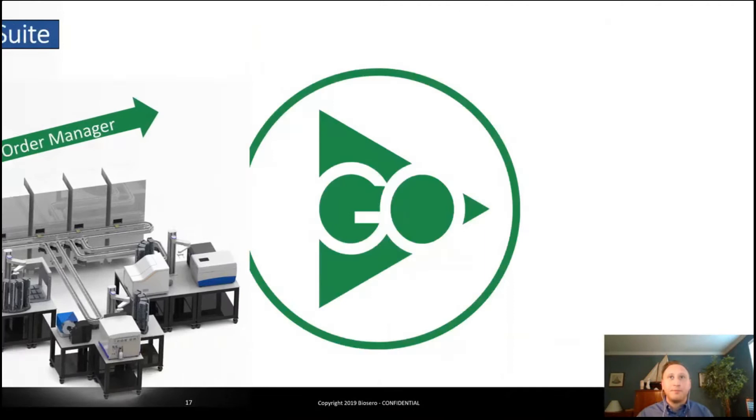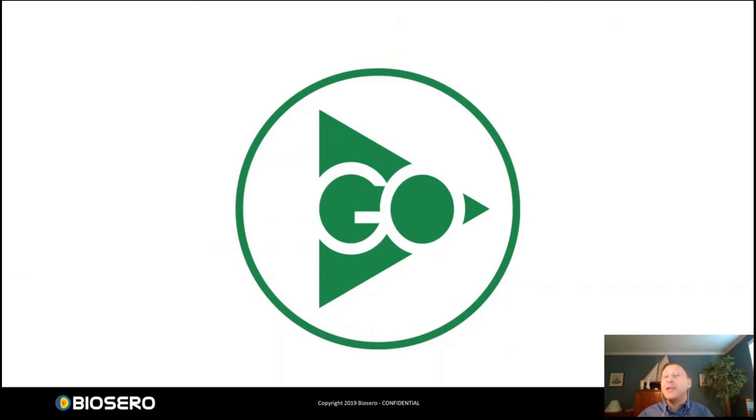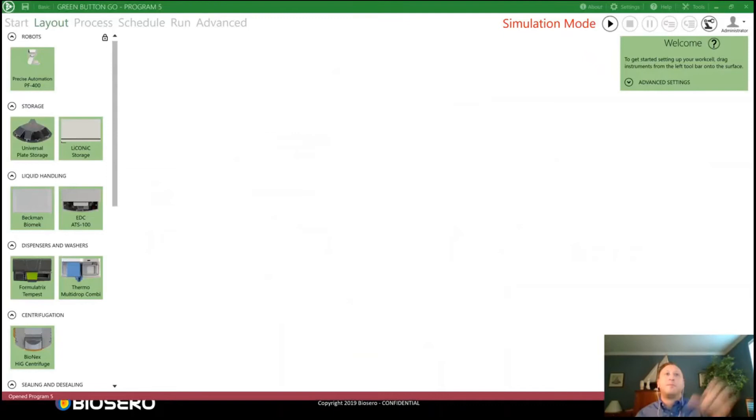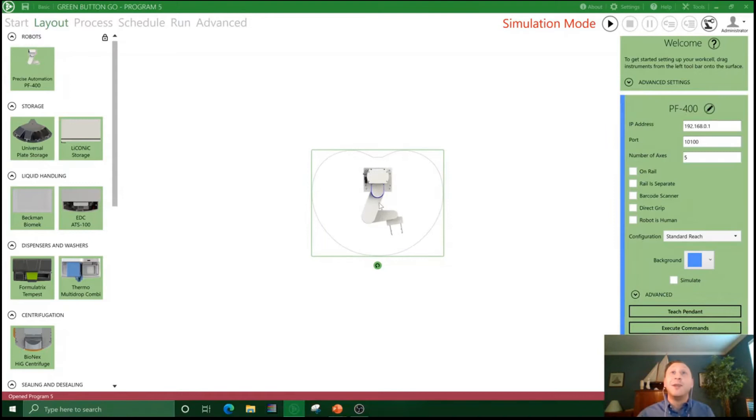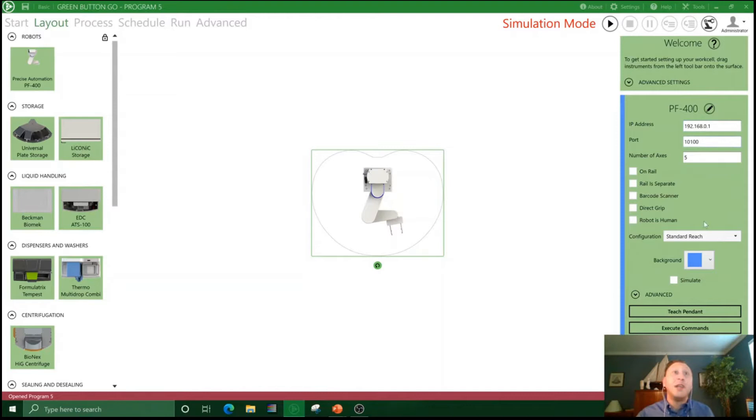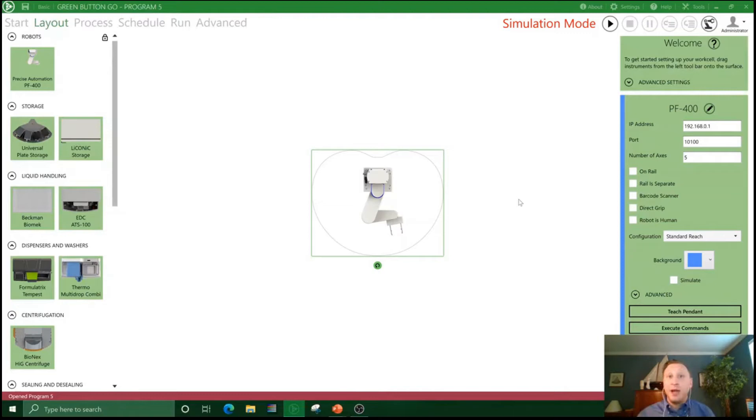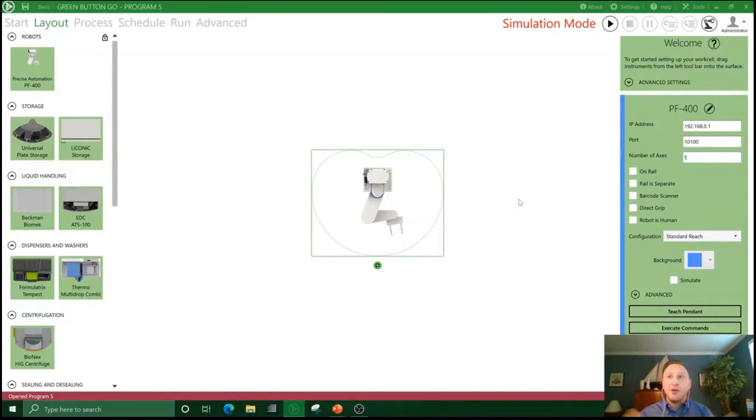So now I won't make you wait anymore. We'll head over to Green Button Go and I can show you how easy it is to set up a basic work cell process. When you first open up Green Button Go, you're presented with your layout screen and the available device drivers you have for the instruments on your system. Starting to build a program is as simple as dragging and dropping an instrument out into your layout. For the sake of our demo, let's envision a small walk-up system to read plates overnight.